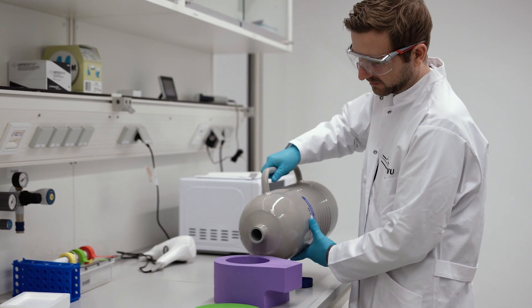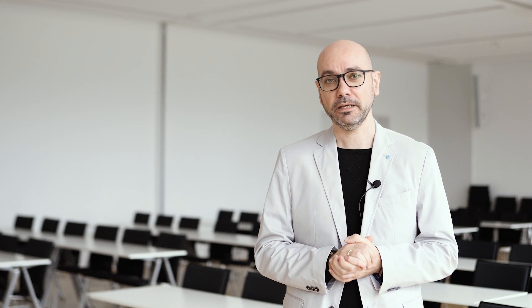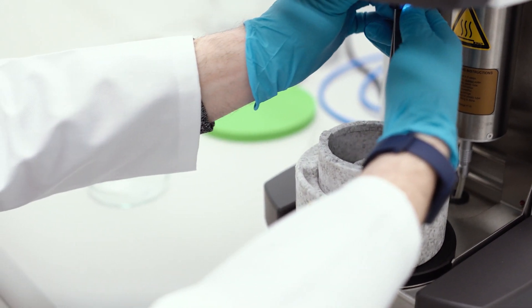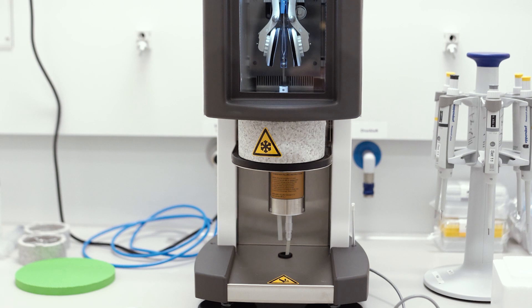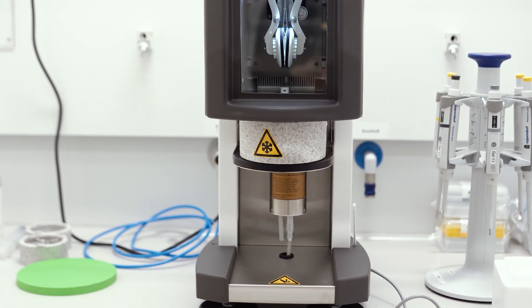For cryo-EM and high-resolution imaging in the electron microscope, we first apply a very small amount of the sample — the target protein — on an EM grid. We need only four microliters of the sample. Then, in this special instrument that we call the plunge freezer, we rapidly freeze the sample.